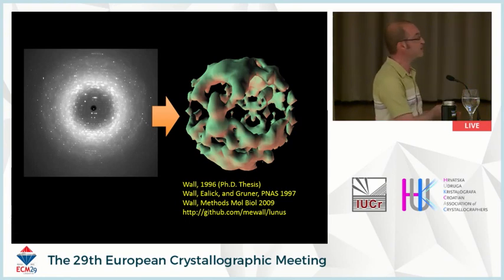This lattice on the right, an isosurface, is essentially the same as a Bragg lattice with some values. Instead of Bragg intensities, those values are diffuse intensities, and they vary in a way that's consistent with the cloudy features you see in the diffraction image.